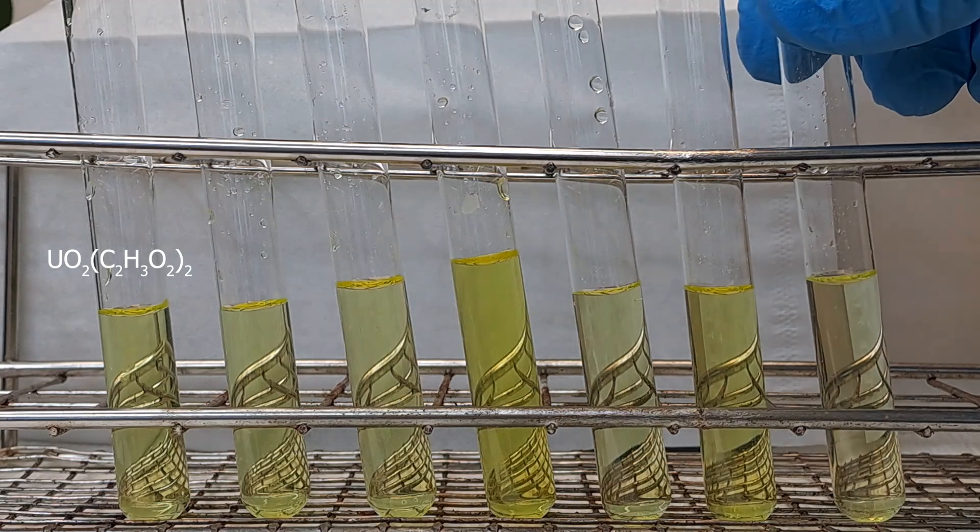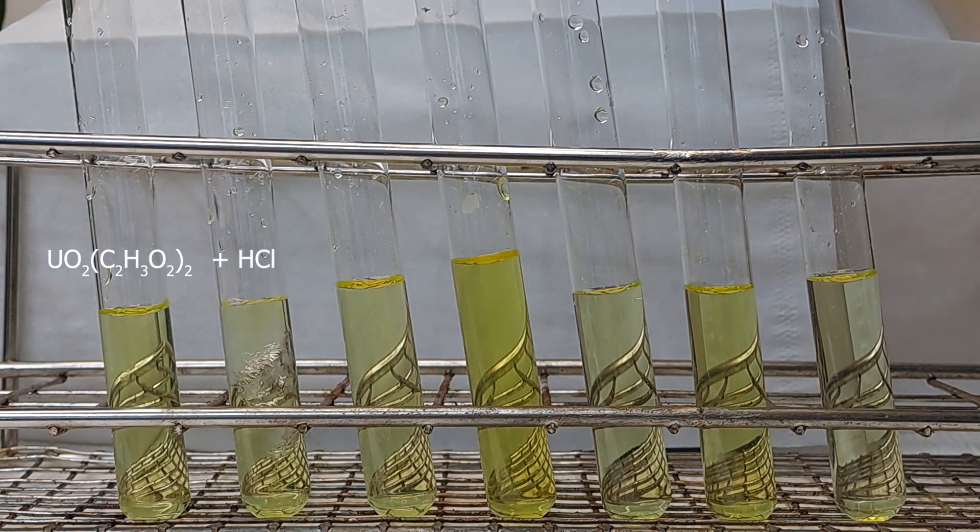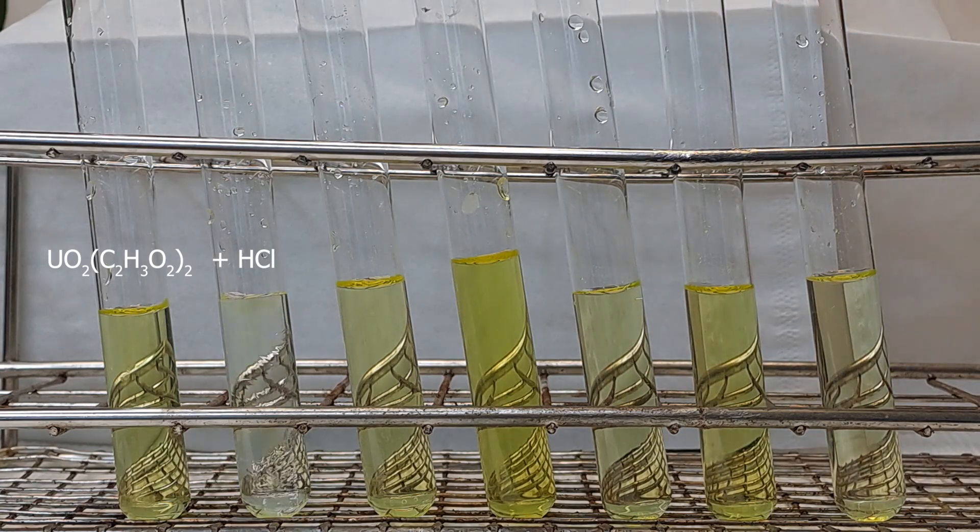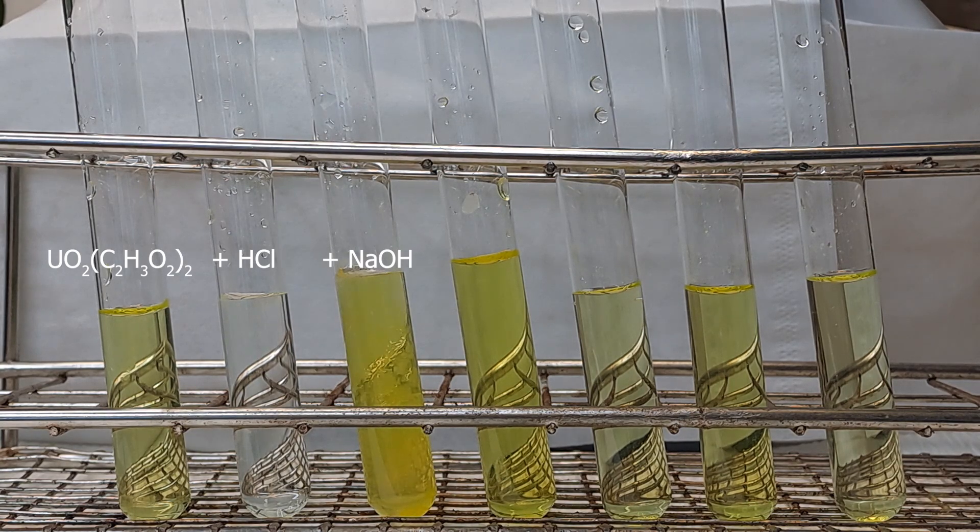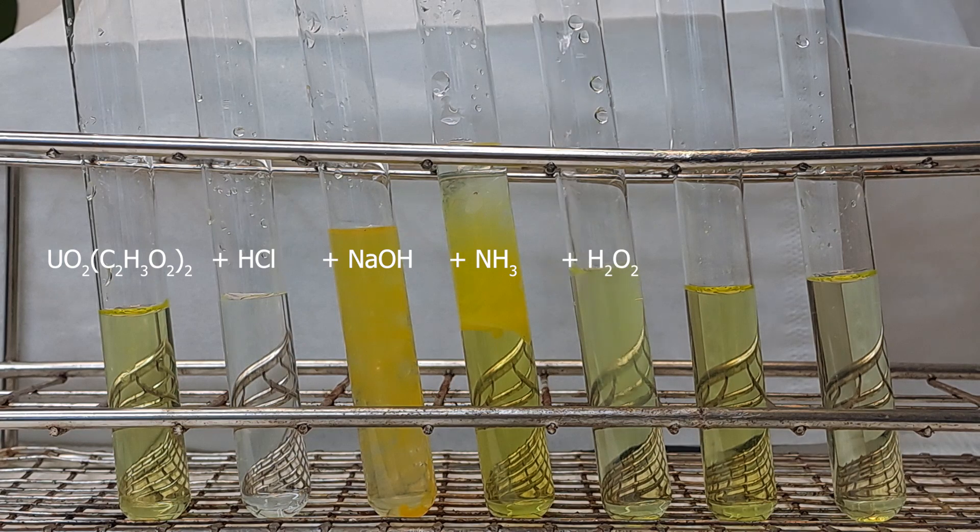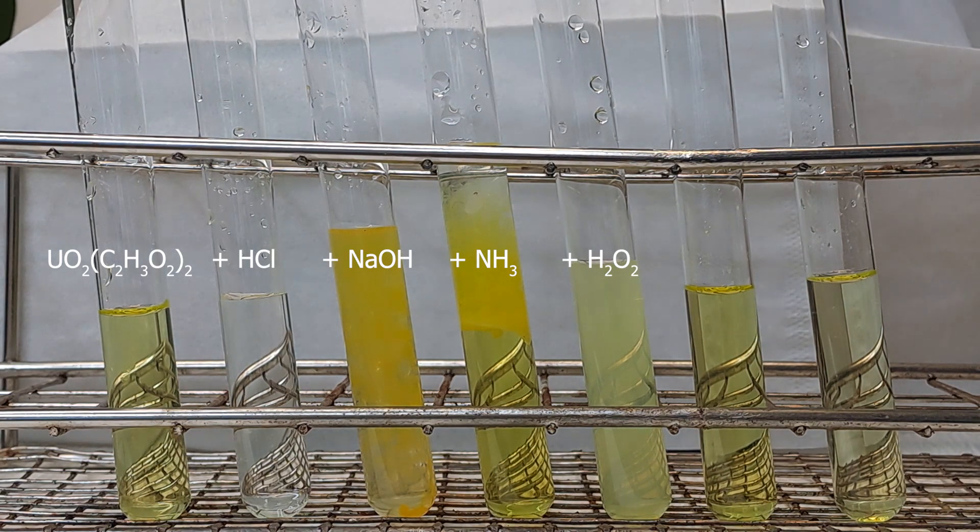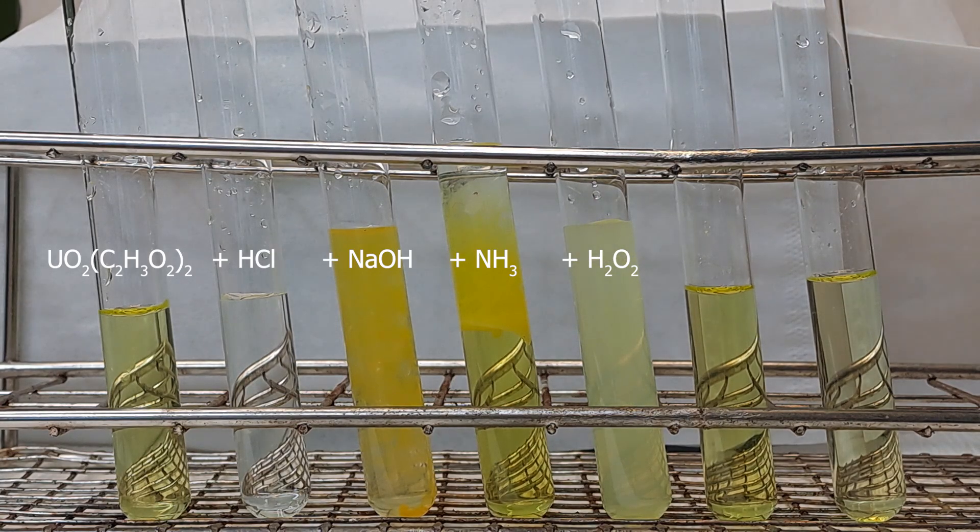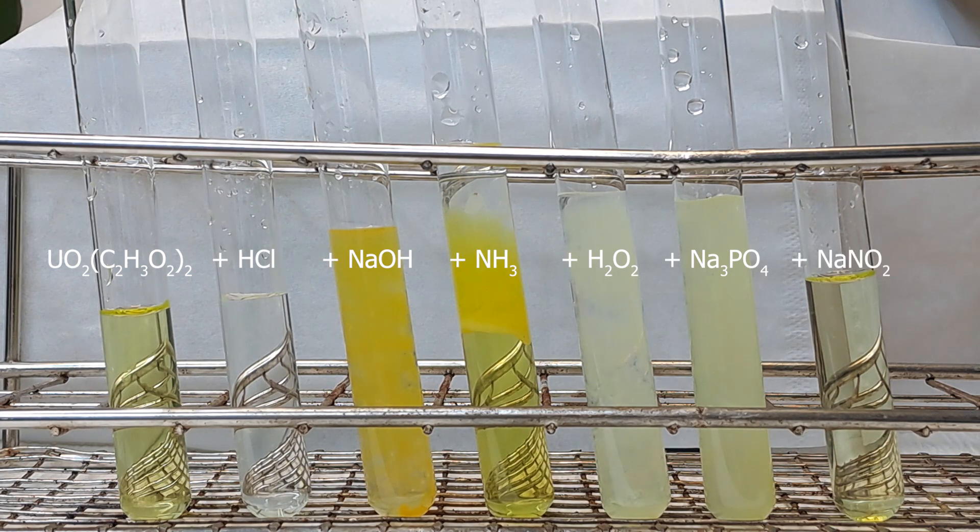Test tube 1 contains only distilled water and now something has happened that I still can't explain after weeks. When 4 molar HCl is added, a decolorization occurs. Adding 6 molar sodium hydroxide causes the formation of a dark yellow flaky solid. Adding concentrated ammonia solution results in a similar yellow flaky precipitate. When 12% hydrogen peroxide is added, a much lighter and finer precipitate forms. Compared to the peroxide, a darker but still light yellow solid forms upon adding sodium phosphate. Adding sodium nitrite causes no noticeable change.